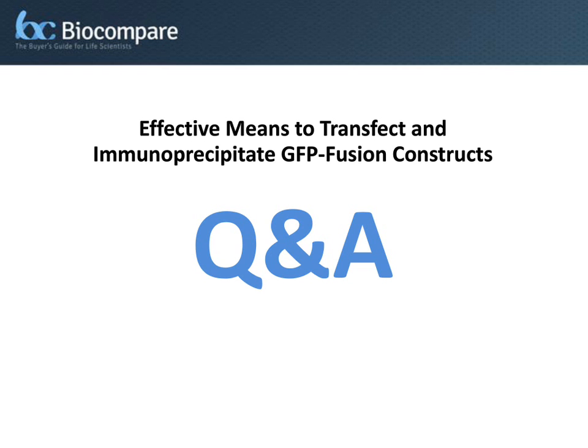Tina, coming back to you, does the GFP-trap recognize modified GFP, so eGFP, for example, or turbo GFP, etc.? Yes, it does. It depends on the sequence of the GFP protein, so it will recognize eGFP, for example. It won't recognize turbo GFP probably, but it also recognizes other GFP proteins or even CFP or YFP, since they are pretty similar. Okay, great.